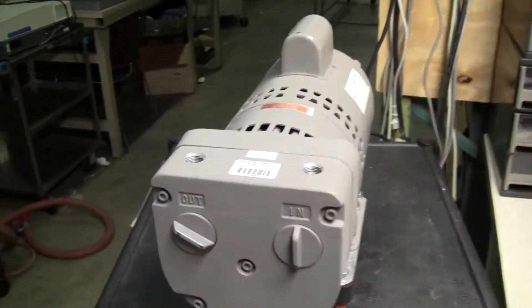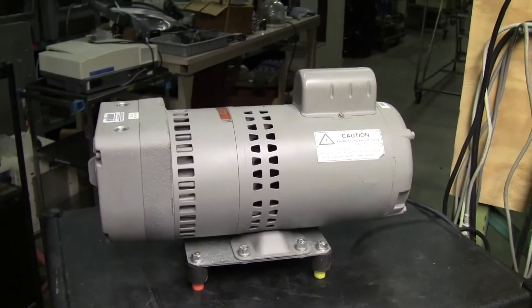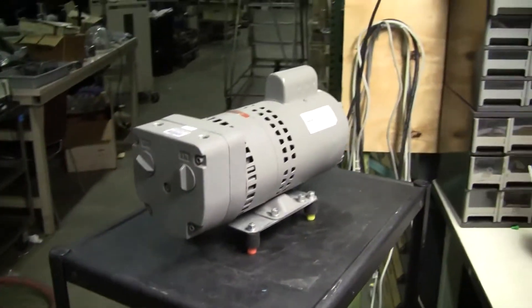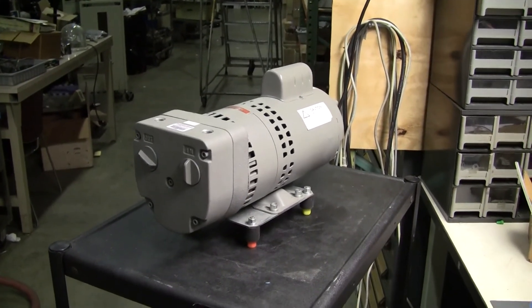The unit's nice and clean. As said before, this unit is used and being sold as-is. Any further questions, please don't hesitate to call 609-518-9100. Thanks again from Hi-TechTrader.com.